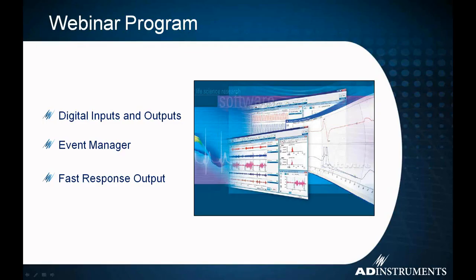And today, this is our webinar program. First, we're going to cover digital inputs and outputs. Like I said, these are built into LabChart. There's no additional plug-in that needs to be added.